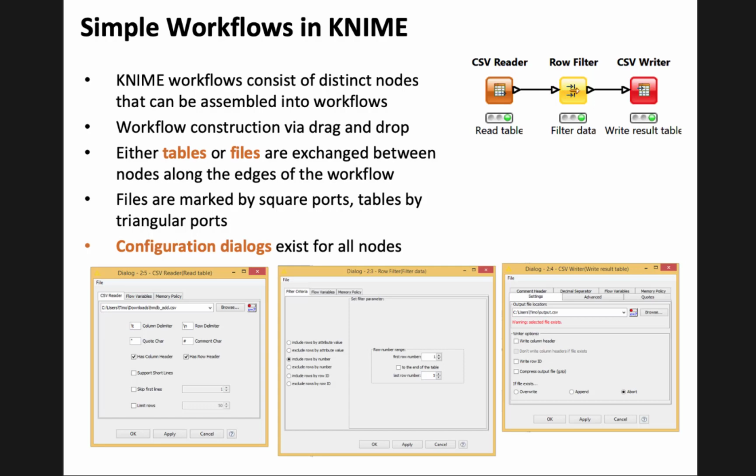I can also open the CSV file in Excel, select the lines, I don't care, and remove them. And that is true. But if you want the same workflow on 1500 files, then deleting the right rows without mistake in 1500 files, you will not manage that. I can guarantee it. So instead, you define a workflow that does what you want it to do.